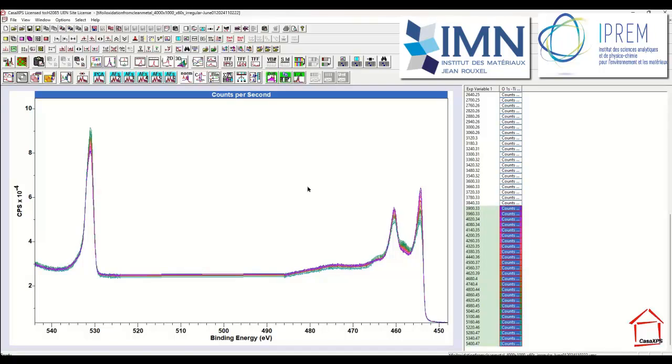These data are now all arranged in a column, overlaid according to the colours we see here. We're only interested in looking at the difference between 2 spectra, but when we organize the data in this format, the difference option will take the first and the last in the sequence, so that I can now construct another VAMAS file that will illustrate visually what these different spectra look like and allow me to inspect and then determine which ones I prefer as potential component spectra for understanding the changes that we see within these spectra here.